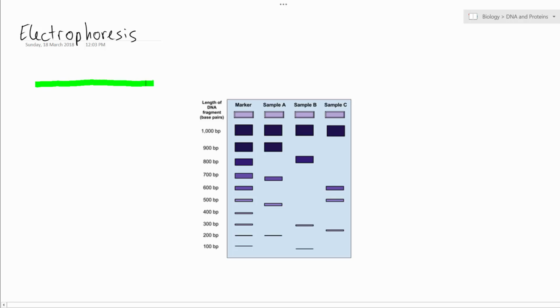So this is going to be sample one. We'll go with our crime scene analogy because this is often one that people find easier to understand. So say we've got two segments of DNA. The green is some DNA from a crime scene that we've got, and the purple is a particular suspect. So someone is suspected of crime. We've got a DNA sample from them.